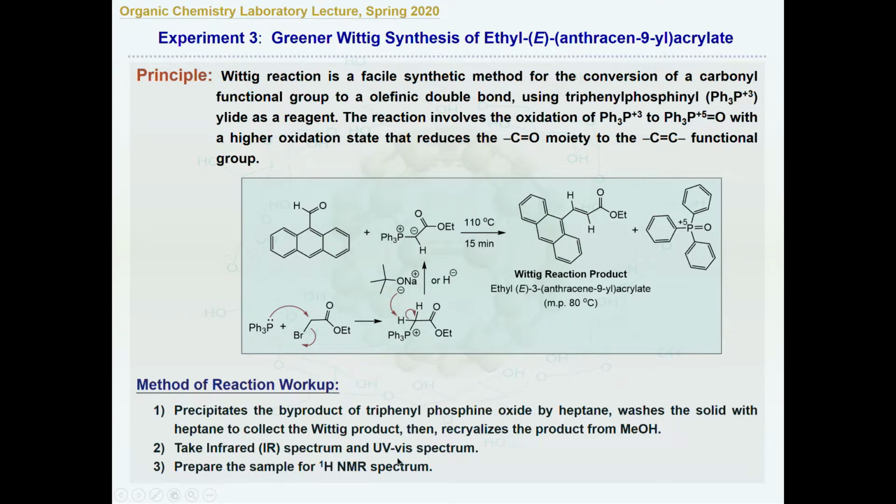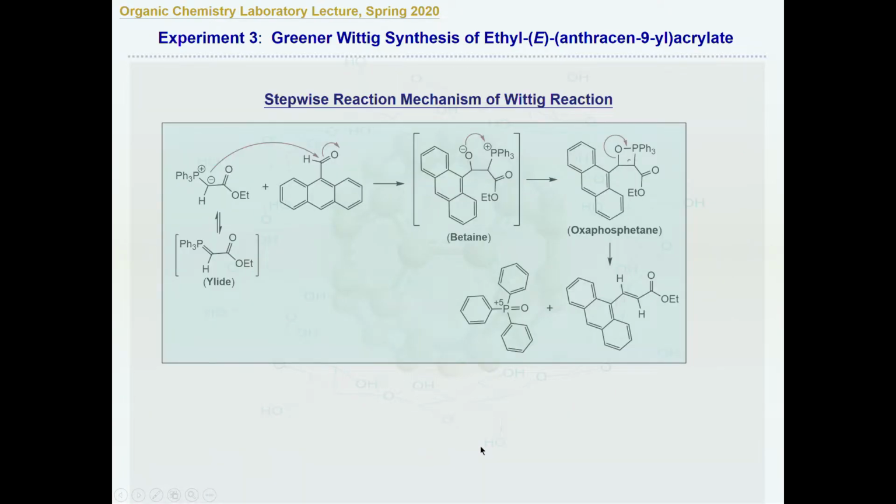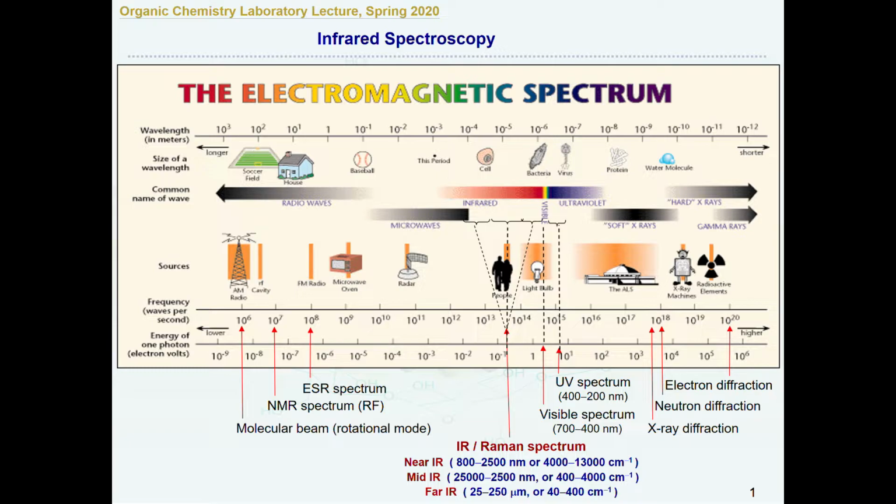Right. The next one will be NMR. NMR is actually more accurate to pinpoint the molecular structure of your compound, and that's the reason I have to go through the NMR spectroscopy today with you.